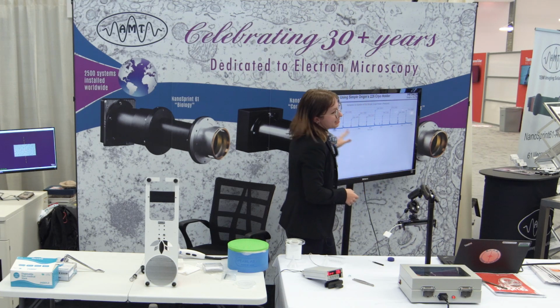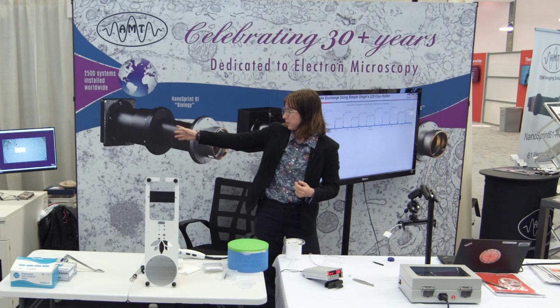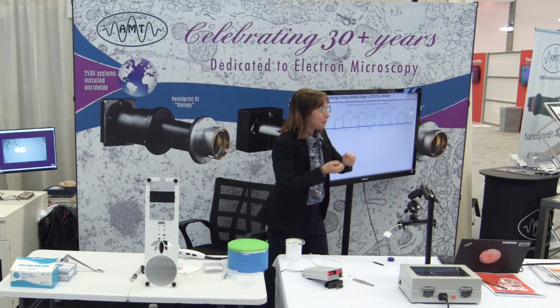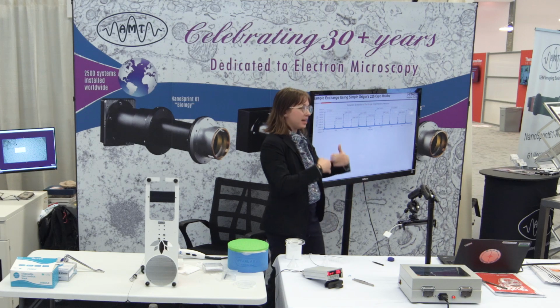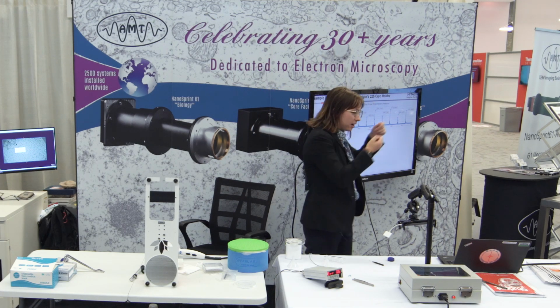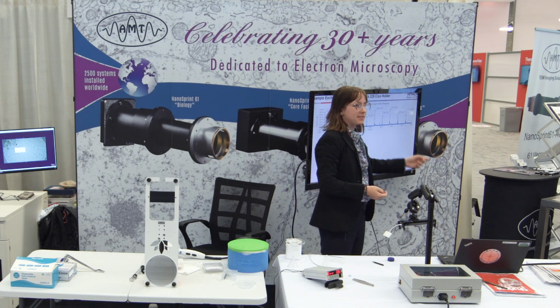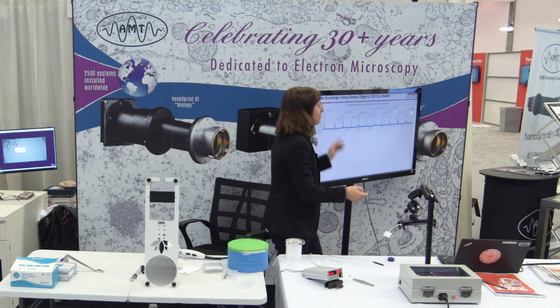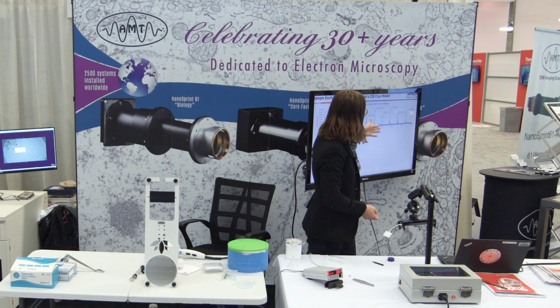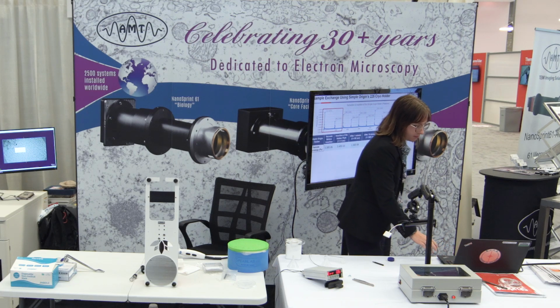So what I've done in this experiment is I have removed the simple origin holder, put it in the transfer holder, and then put it back in the scope over and over and over again to see what our vacuum levels can hold and how many times I can repeat this process. After about 5 times, I got tired and said, okay, five's pretty good, but I kept going because you can see around the range that it's fairly stable in terms of vacuum levels.